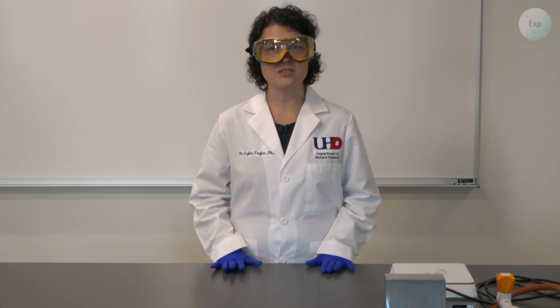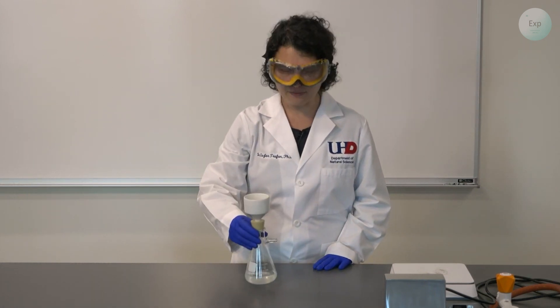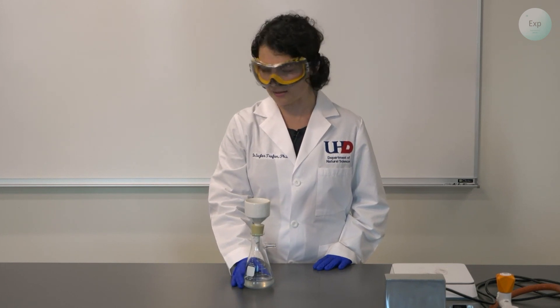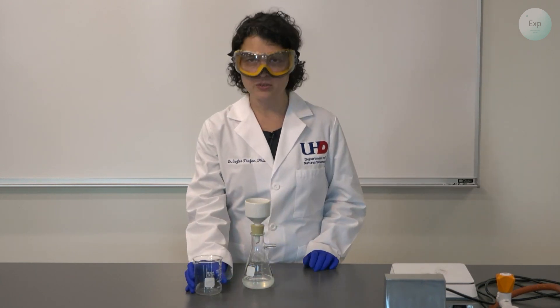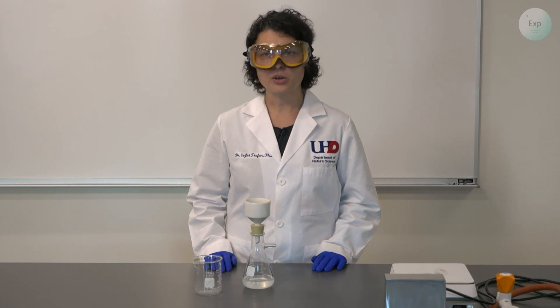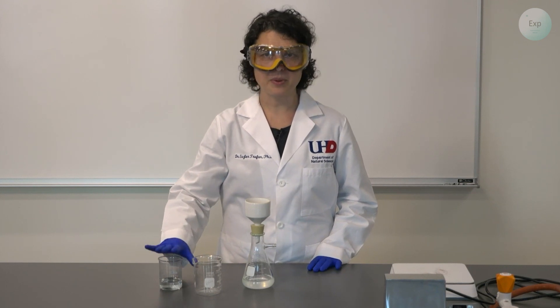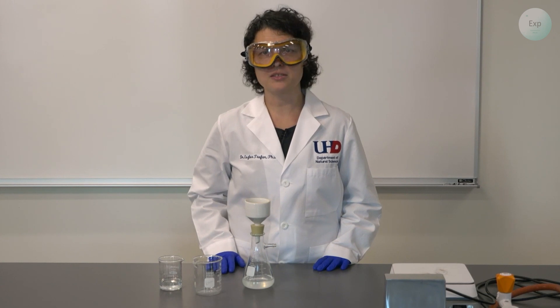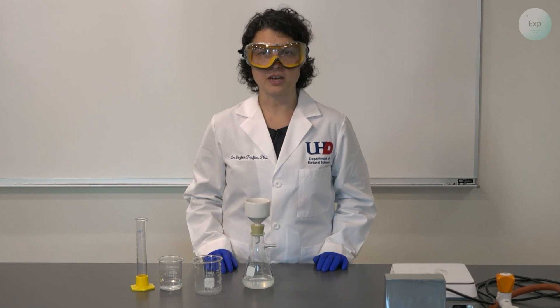For this experiment we're going to start where we left off last time — here we have our calcium chloride solution, which is the filtrate in our filtration setup. We're going to transfer this into a 250 milliliter beaker. Next, we're going to precipitate it using a previously prepared saturated sodium carbonate solution. We'll need a 50 milliliter graduated cylinder to measure its volume.